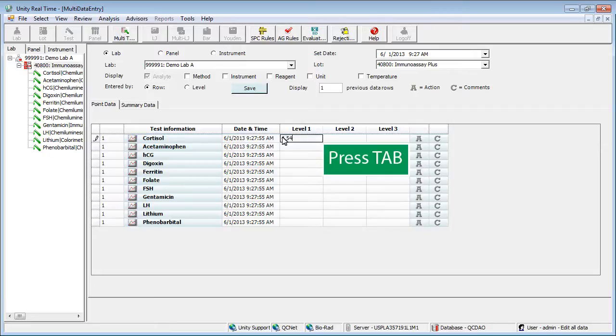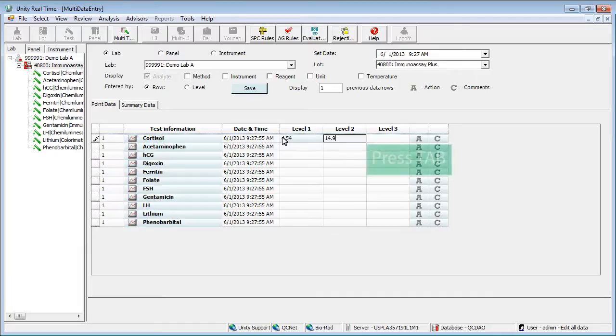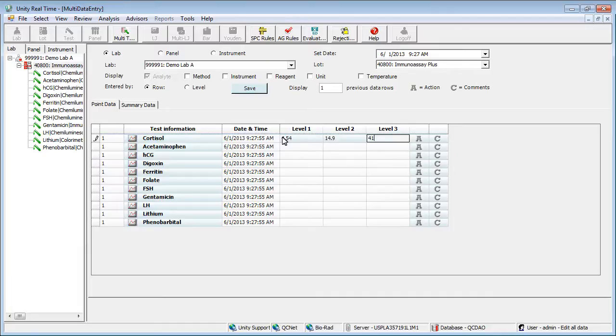Press tab to move to the next field. Continue entering data for each test, then click Save.